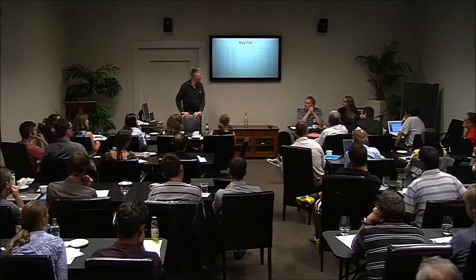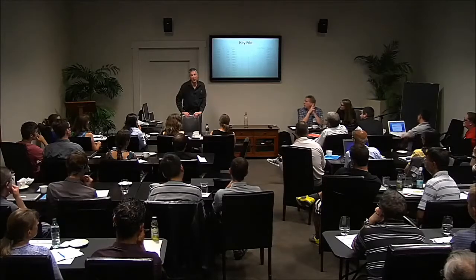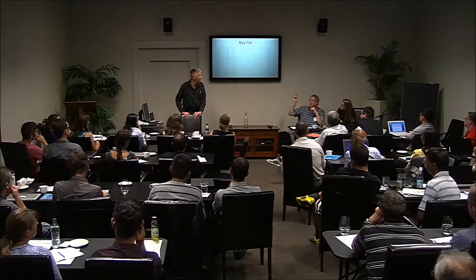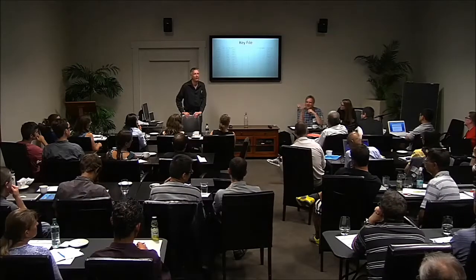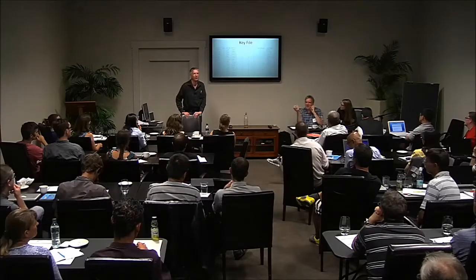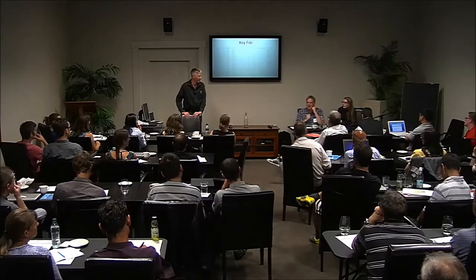Yeah, there's DNA sample IDs. You're not seeing it in the key file. There are additional data structures that hold this kind of information. The library prep ID comes from a particular DNA sample on the well, in a particular library prep. So it's one of those wells on the plate where you would have stuck a certain barcode in on this one plate, right? There's a lot of information that you might want to keep track of that may or may not currently be supported by your database.